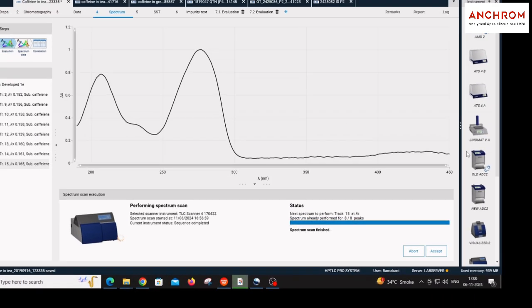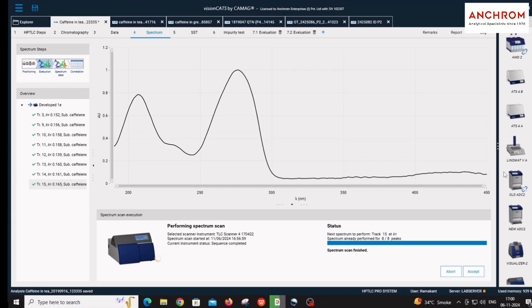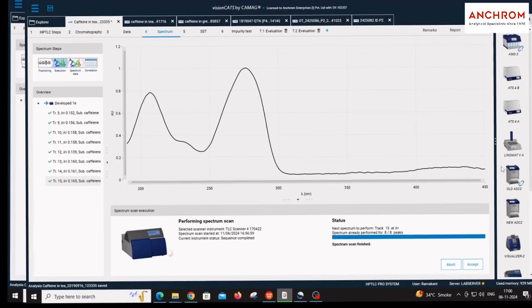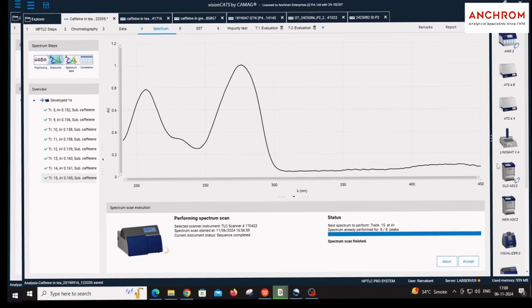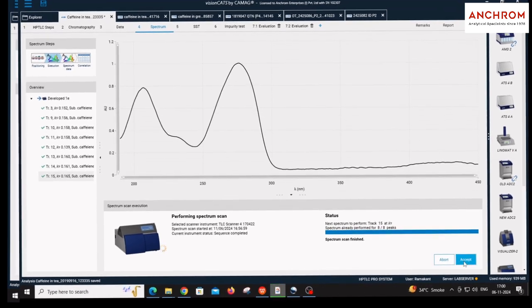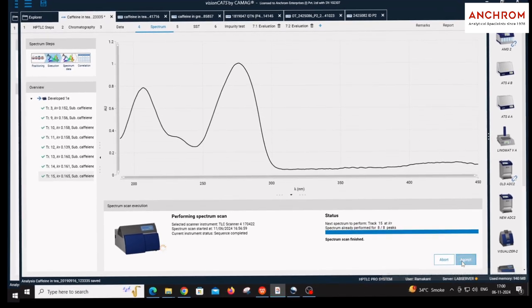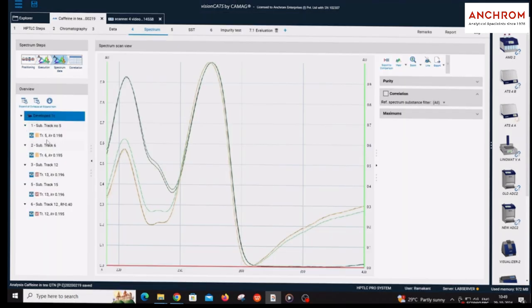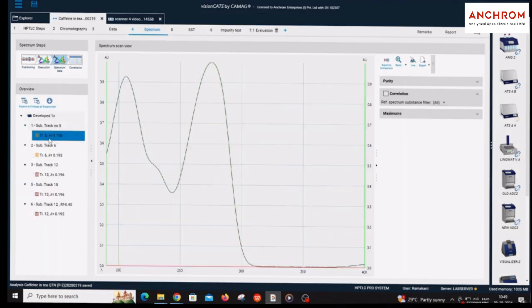One by one spectrum will be generated. After all the spectra are generated, accept all the spectra. Click on substance under the spectrum data and check individual spectrum.